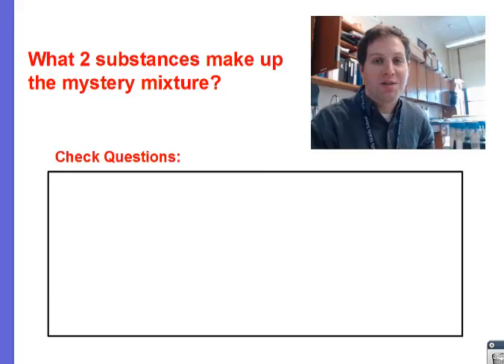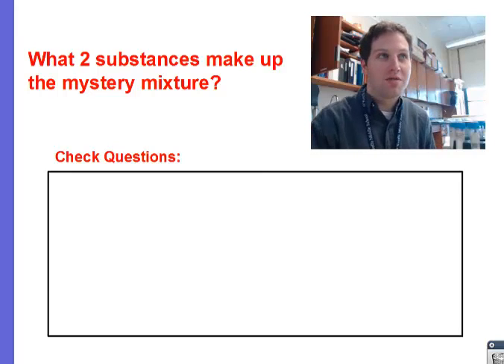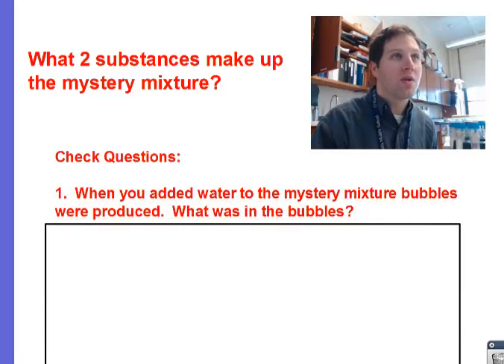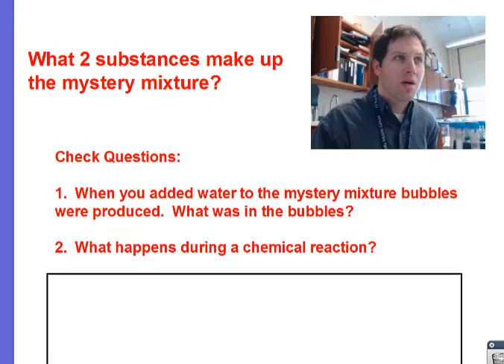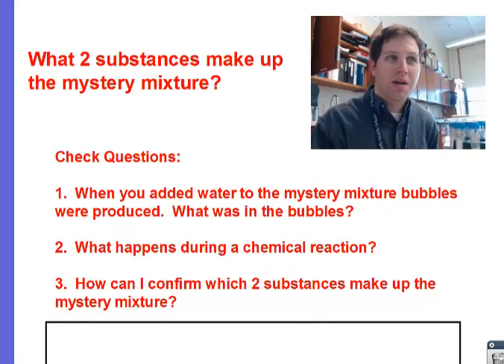Today we're going to continue our search to figure out which two substances make up the mystery mixture. At the end of today's video, you should be able to answer these three check questions. Number one, when you added water to the mystery mixture, bubbles were produced. What was in those bubbles? Number two, what happens during a chemical reaction? Number three, how can I confirm which two substances make up the mystery mixture?